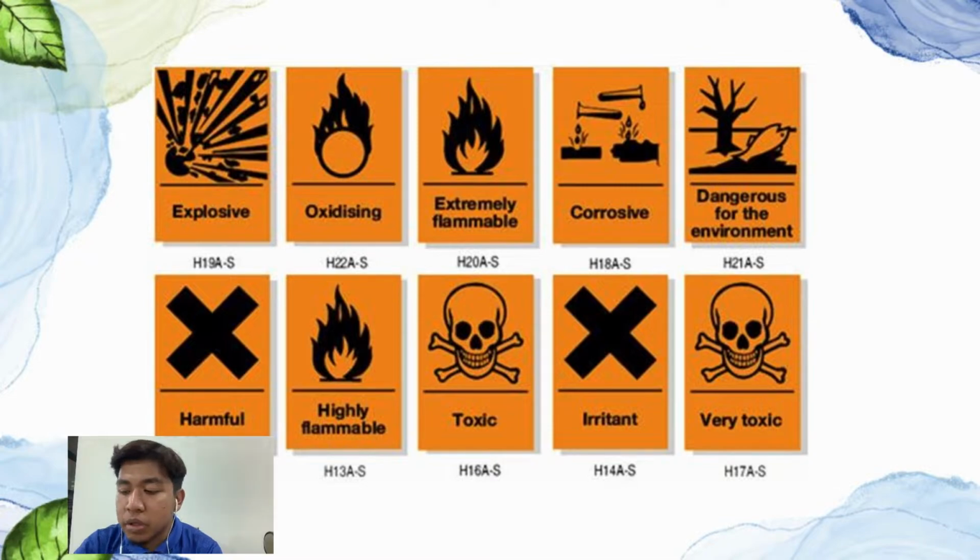The main purpose of the experiment is to identify and know the function of each symbol in the laboratory and also in the nursery, where the more we observe the rules of the symbols in the laboratory, the less the probability of accident or injury.